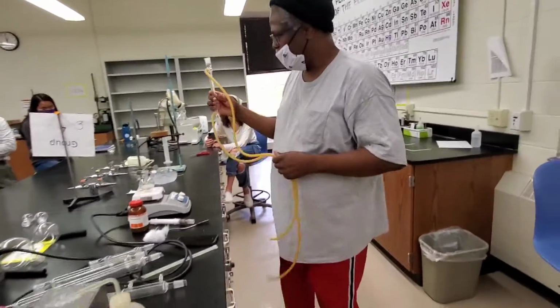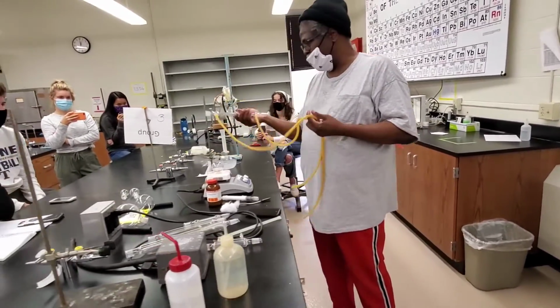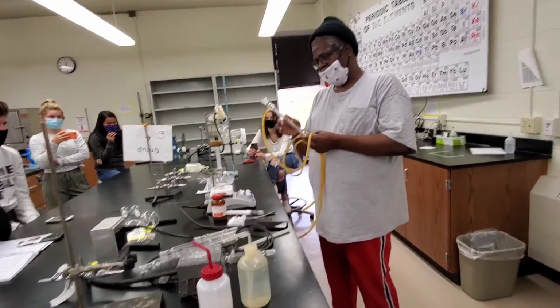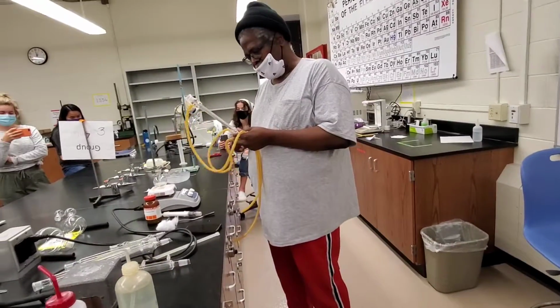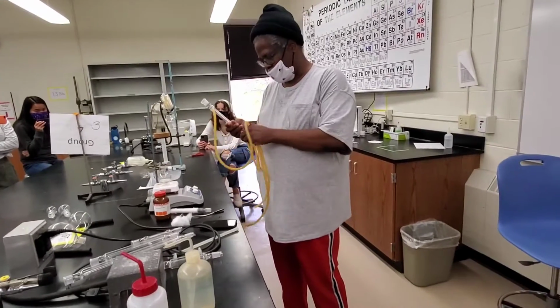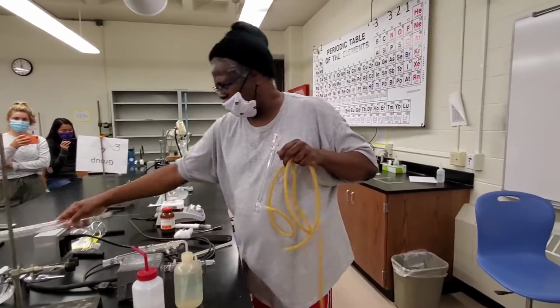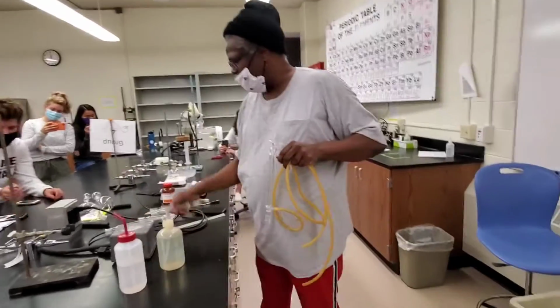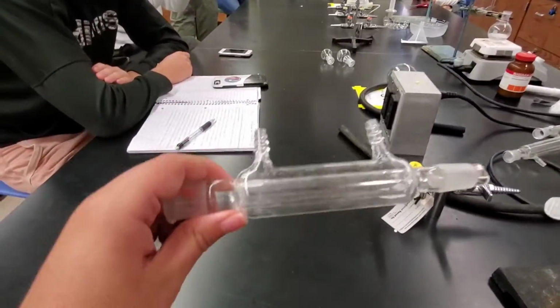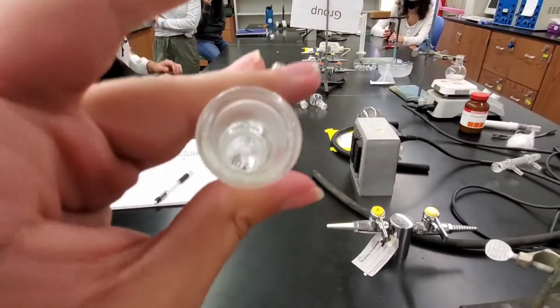Before you start putting flowing water through a condenser, because we don't know if it's broken or chipped or something that may allow water to start to seep out, we need to test it. Notice in these condensers, you guys can pass these around, there is an inner tube and an outer tube. So the water is going to flow inside between those two tubes. Okay? You guys can take a look.